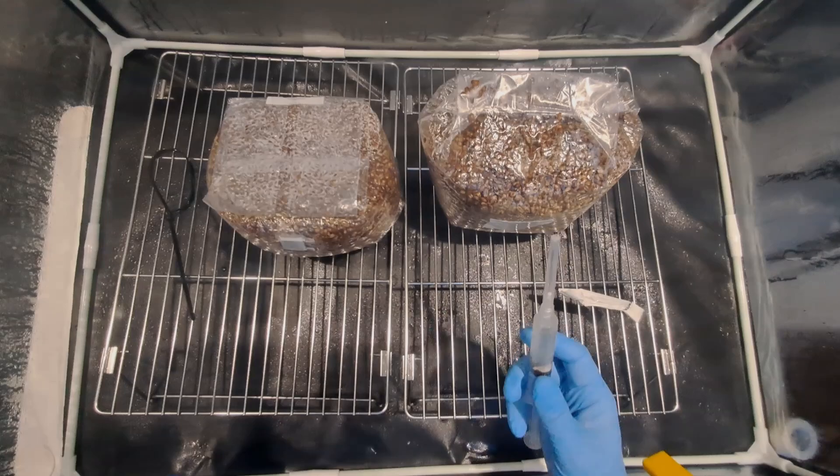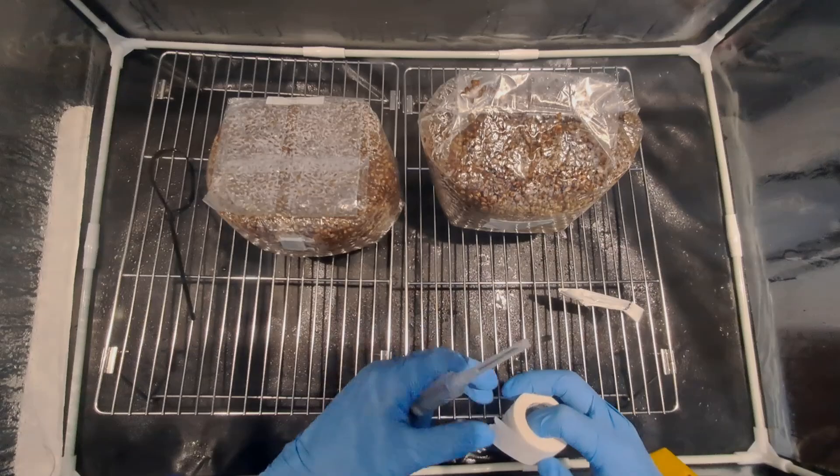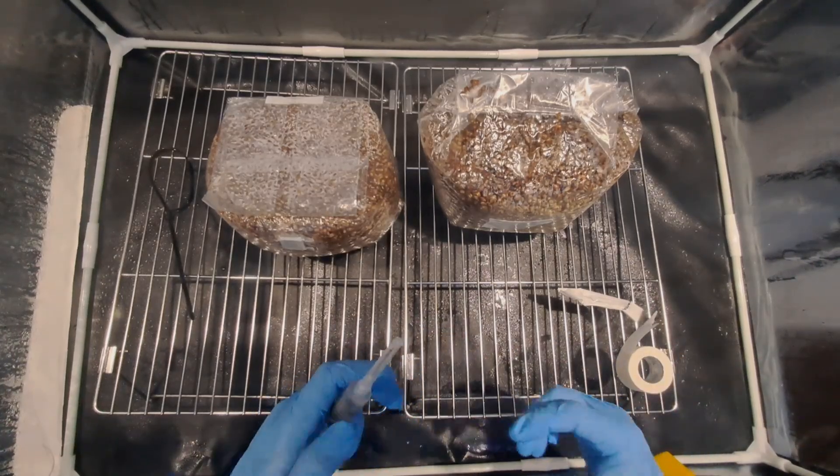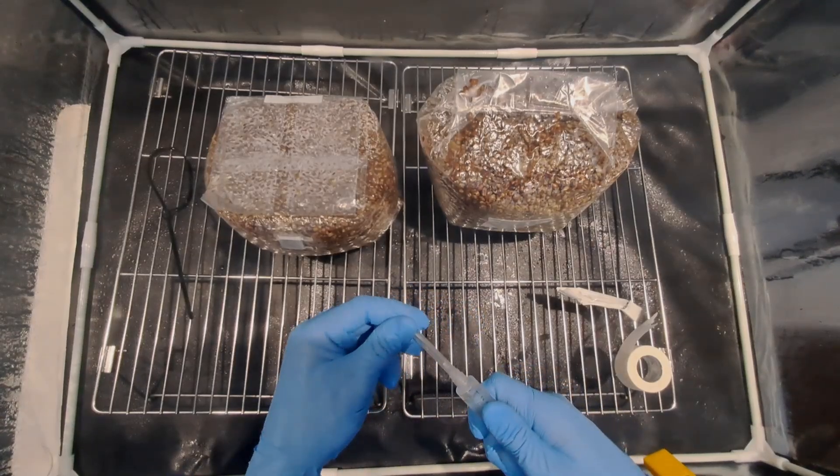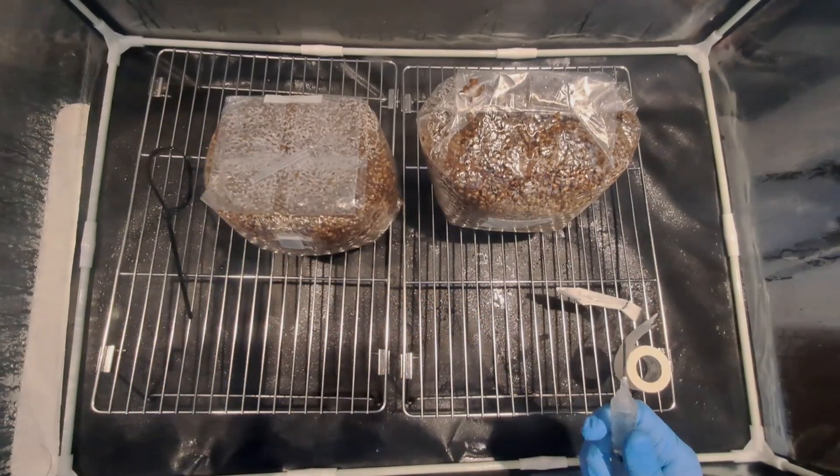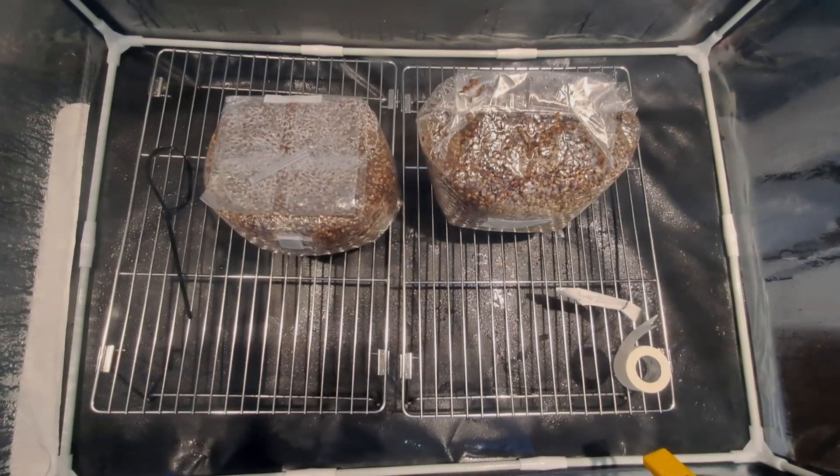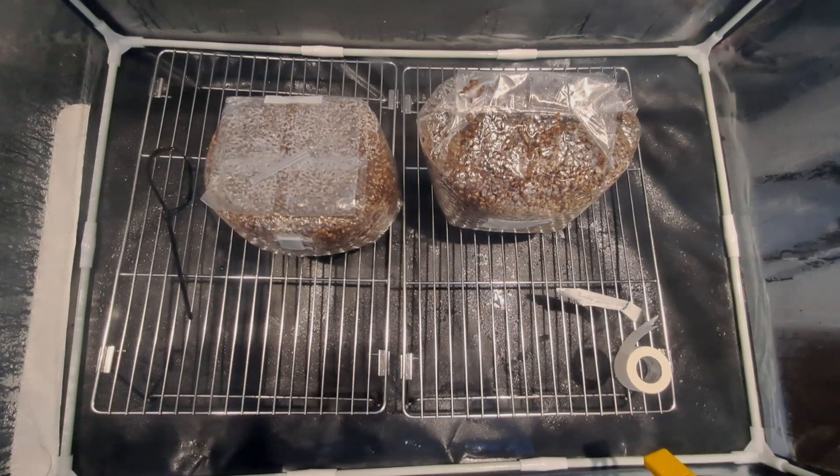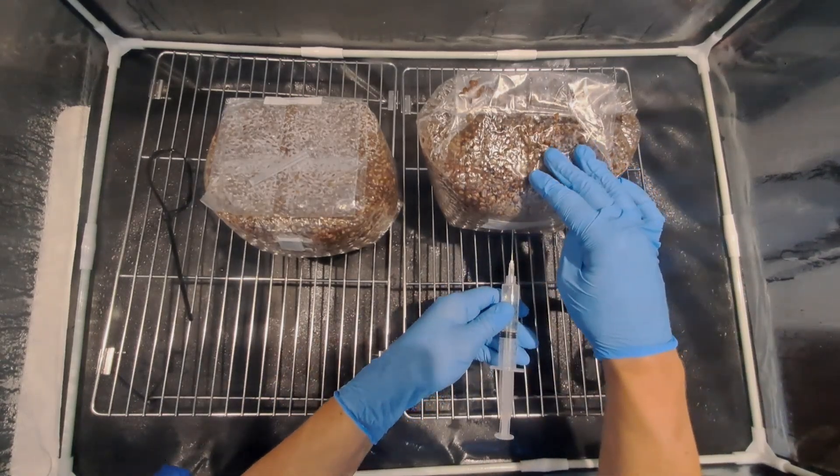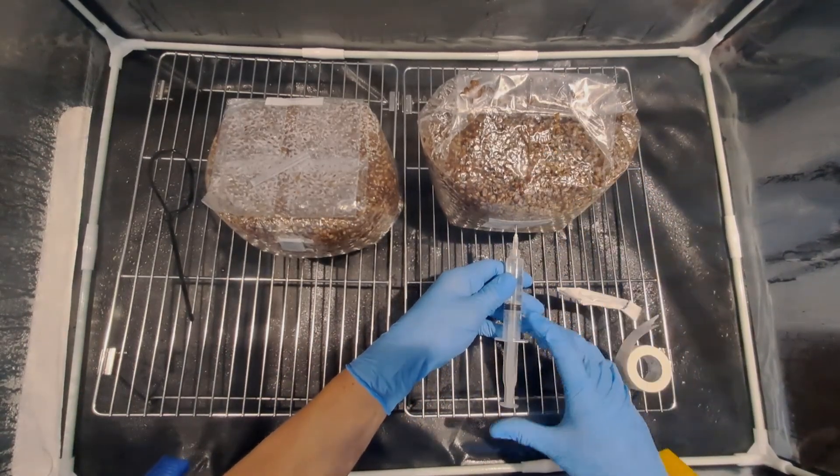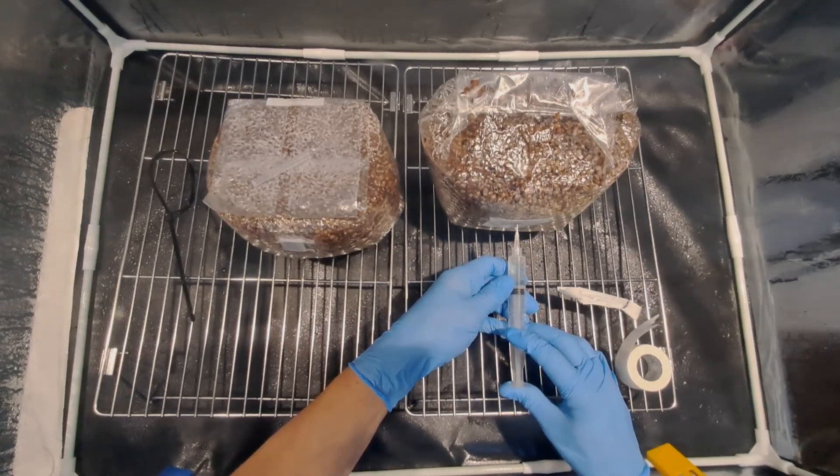I've prepared the micropore tape to close up the hole after inoculation so putting that within reach. Flame sterilize my syringe outside the still air box. While the syringe is still glowing red I'm going to return it to the still air box and inject through the micropore tape. When I remove the needle I'm then going to cover up the hole with a second layer of micropore tape.